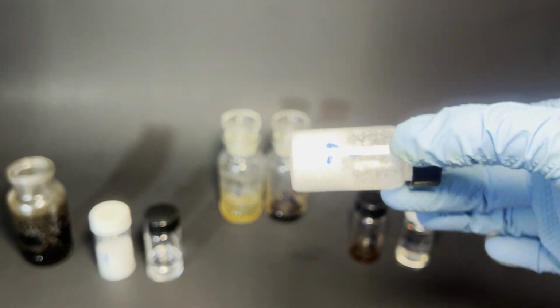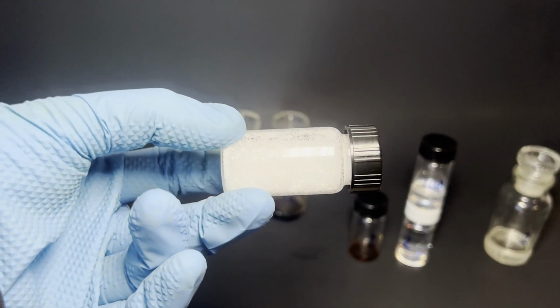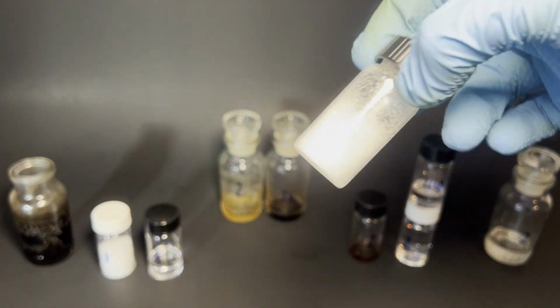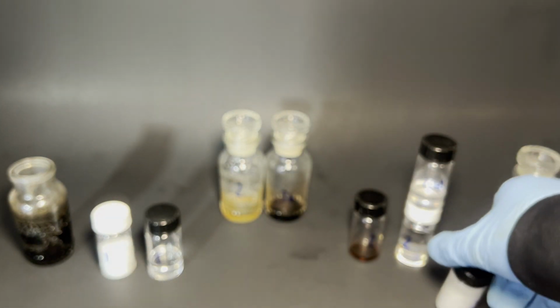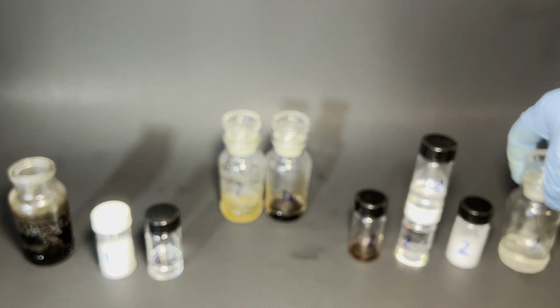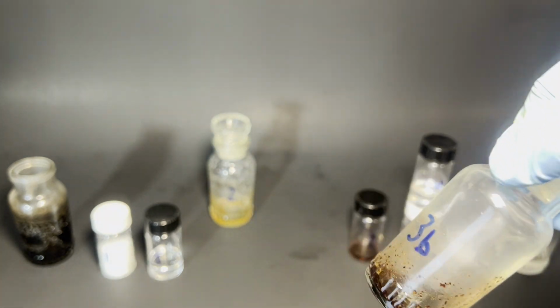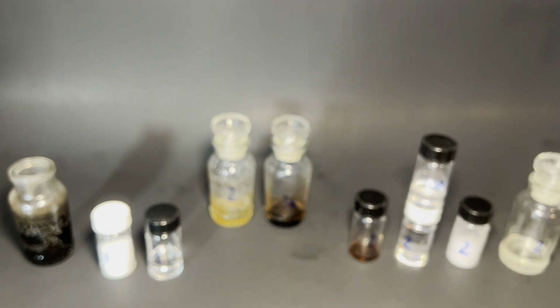The main things I care about are the vials containing white solids, which is the p-dichlorobenzene. The recovered chlorobenzene I can combine and use in the other project I mentioned that I was going to use some chlorobenzene for. I don't have any use. I can't think of anything. I looked it up, couldn't find anything. Any use for ODCB. If you have any ideas, let me know.